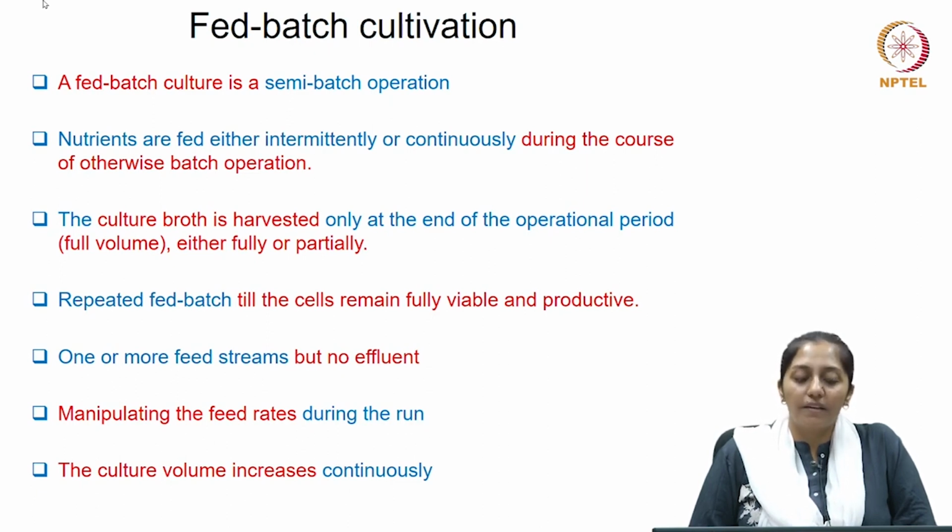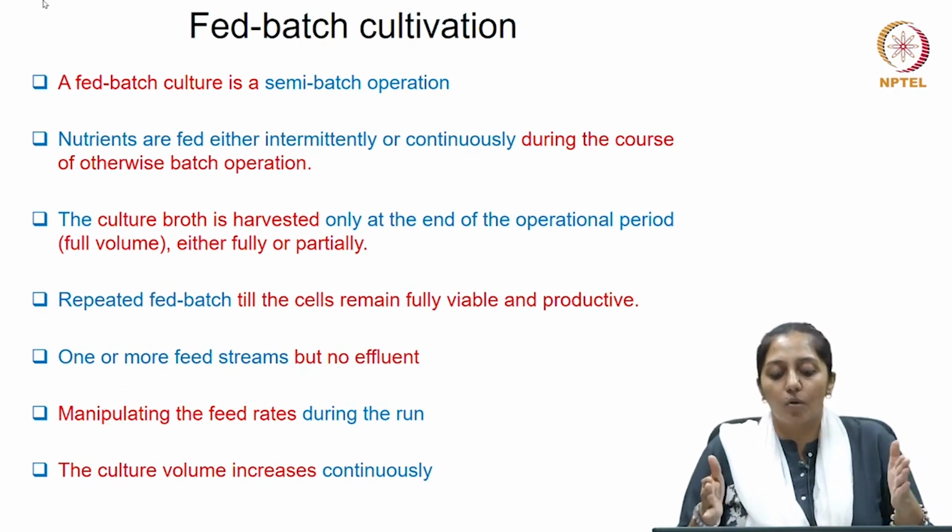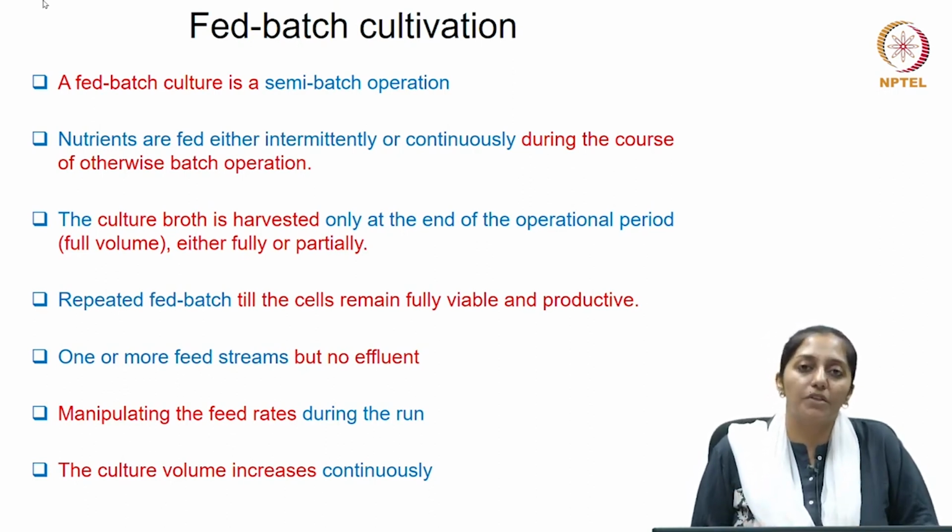Just to reiterate, a fed batch culture is also called a semi batch operation. Nutrients are fed either intermittently or continuously during the course of an otherwise batch operation.